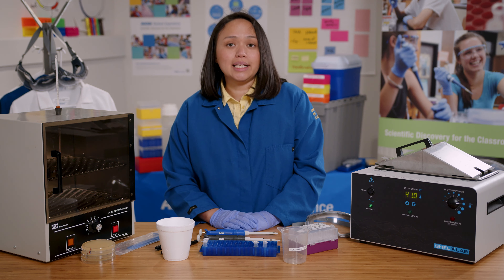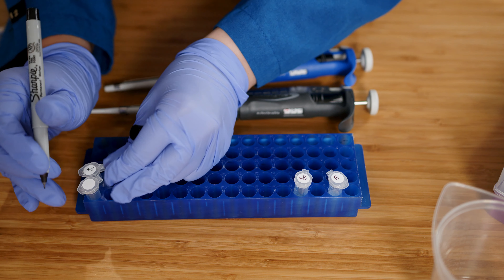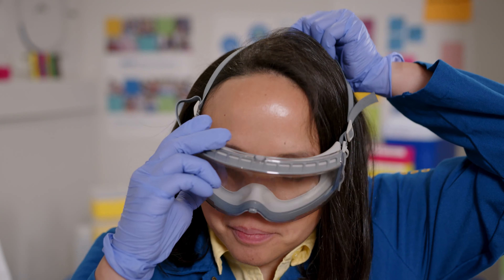Before I begin, I need to label the tubes. P+ is for the experimental setup and P- is for the control setup.